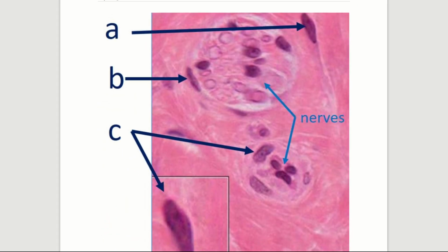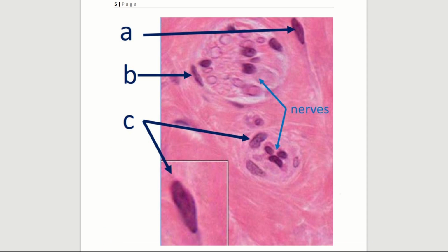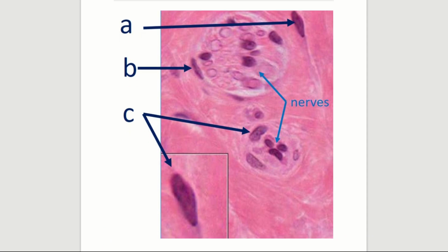Okay, this one right here. So this one right here also has to do with connective tissue. Okay, and so as you can see here, we're pointing to some different cells within this connective tissue. He already told you these are nerves, right? These bundles are nerves. What he's asking you about are the cells lining the kind of extracellular space hanging out here around the nerve bundles.